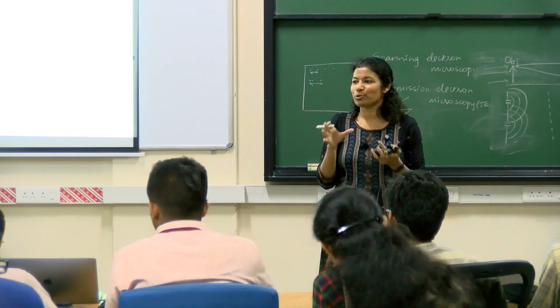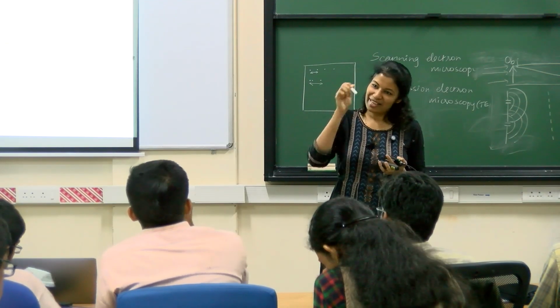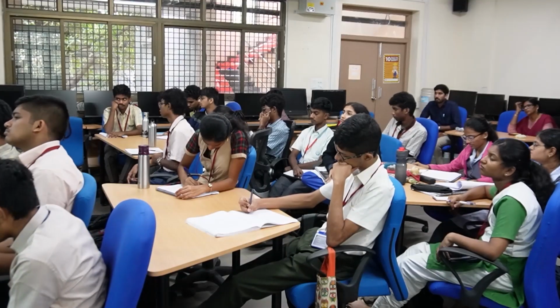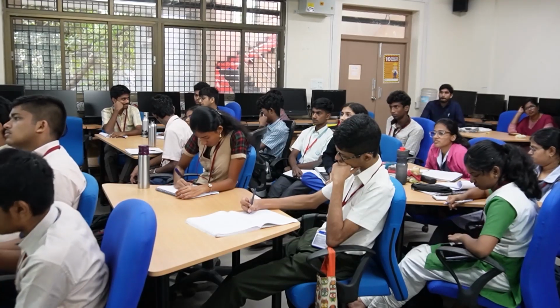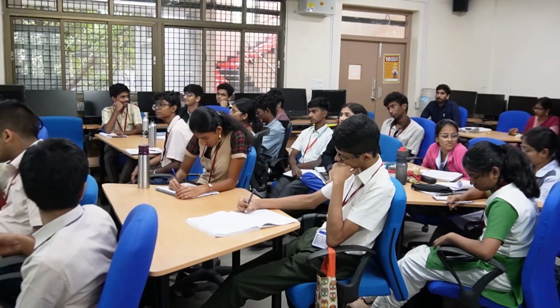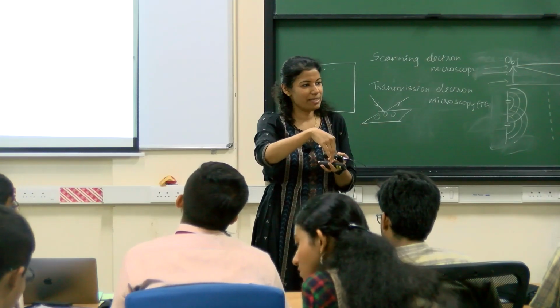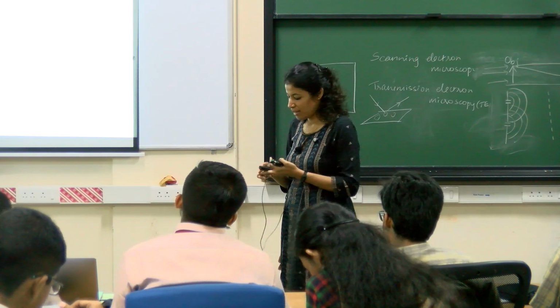Like I need a light microscope to show you how the grid looks. Inside that there are holes where you will have your sample. So it will look like this. This is your metal grid support. In between, your sample is hanging, because of surface tension there will be sample over there. Then the electron beam interacts with this sample and you get the image below. That's how you see it, right?